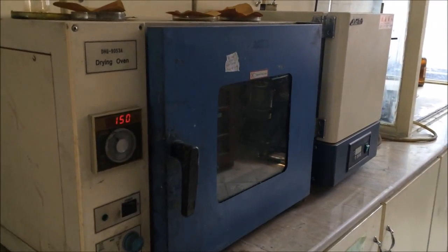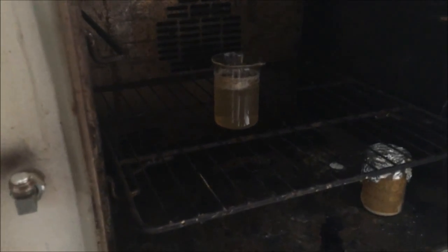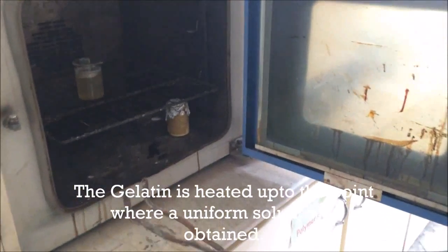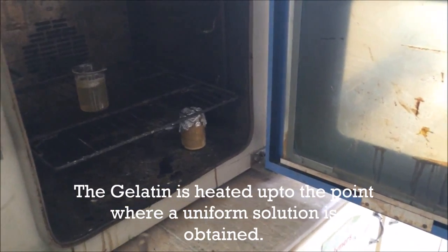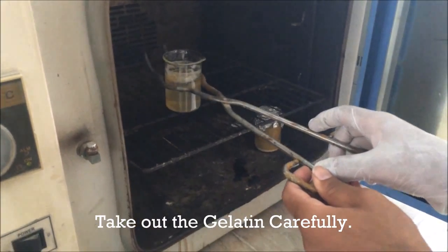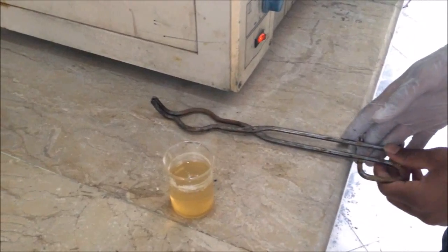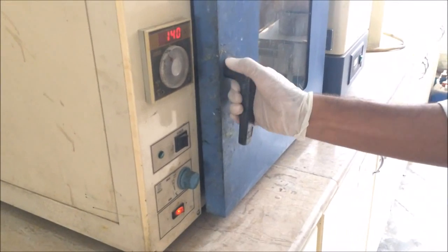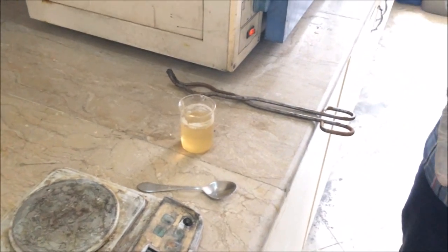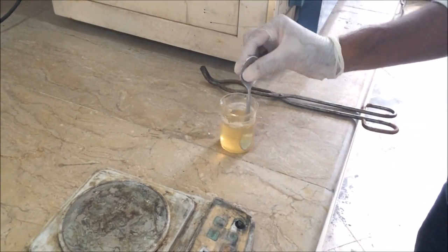Now our 20 minutes have passed. We will check whether our gelatin is ready. We will open our oven — you can see the gelatin is almost ready. We will bring it out with the help of this scissor-like gripper. Take precaution as it is very hot. After closing the drawer, we will wait for it to cool down. You can see that with the help of the shear, the gelatin is almost ready.